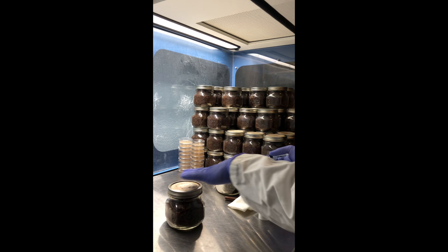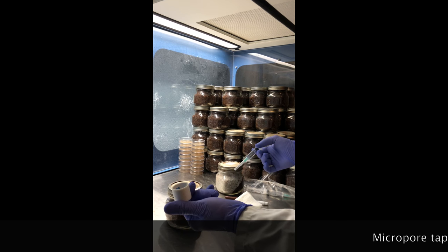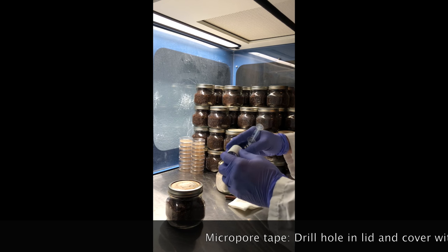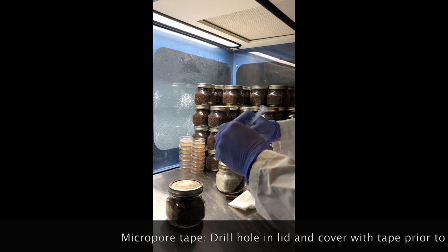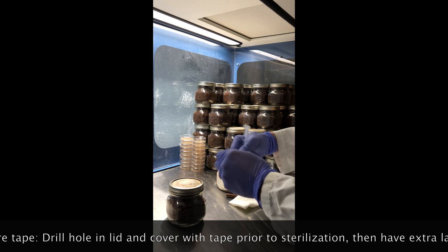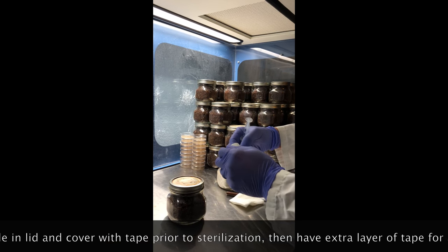After you wipe the lid, you want to get yourself some micro-pore tape. This is about 50 cents a roll, and you'll want to get this ready. After you inoculate your spores, you'll cover it with the micro-pore tape and that will prevent any more bacteria from getting in.